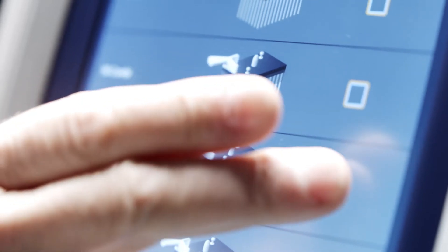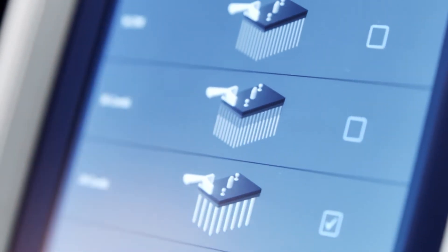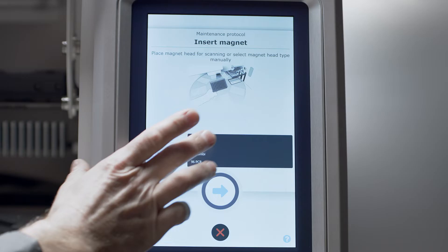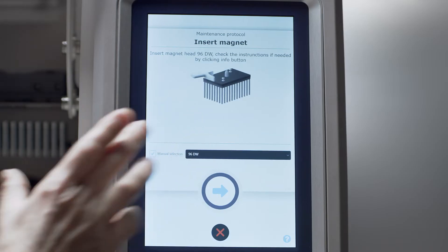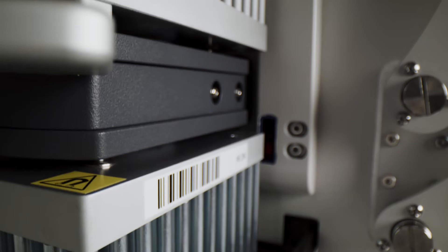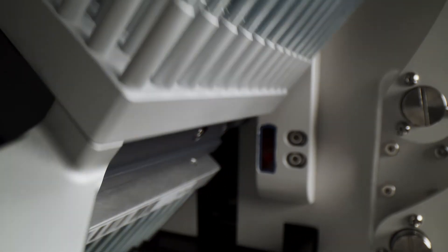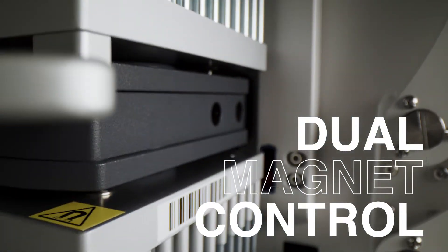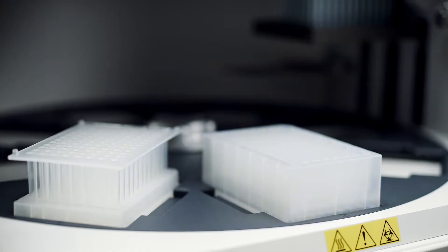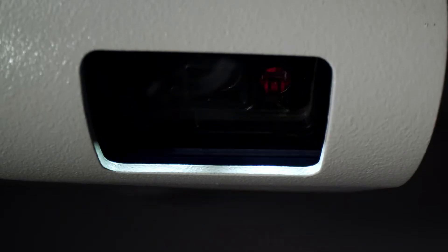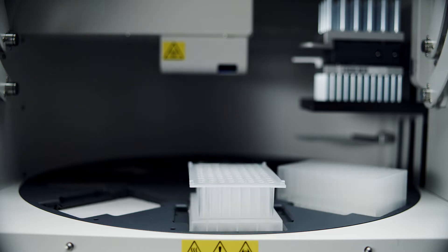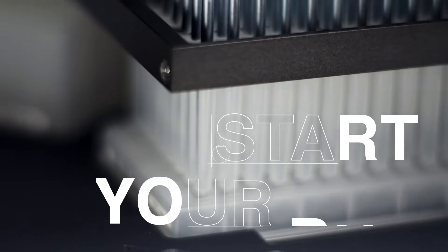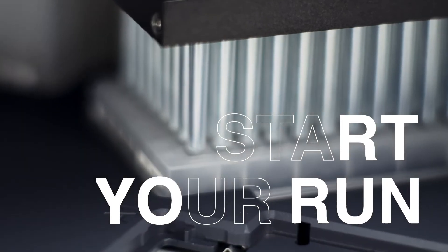Control all instrument settings from one screen with guided visuals. Once you select a protocol, Kingfisher APEX identifies the correct magnet head and plastics. Barcode scanning confirms proper plate position during loading, so you can start your run and walk away.